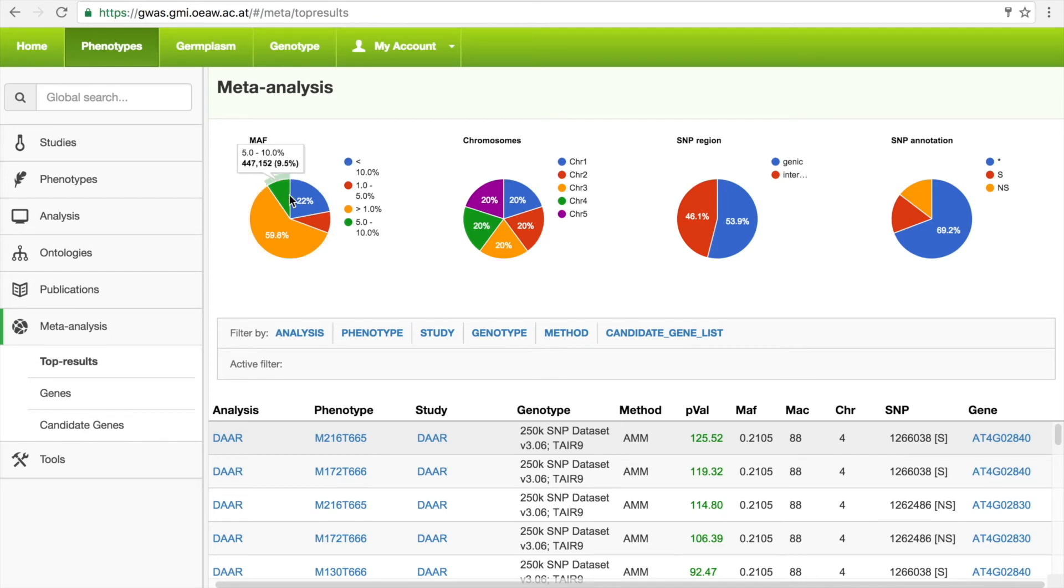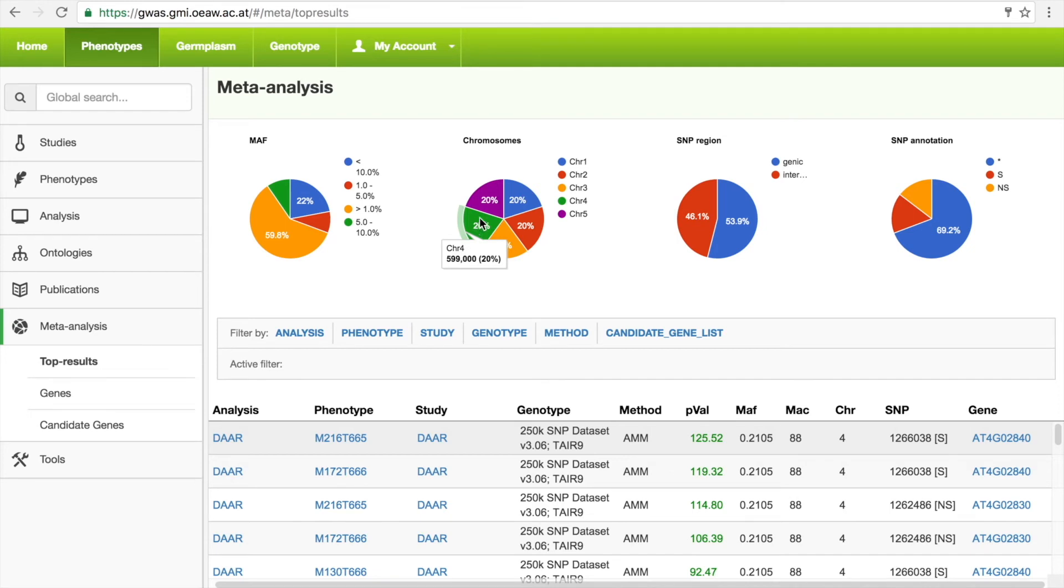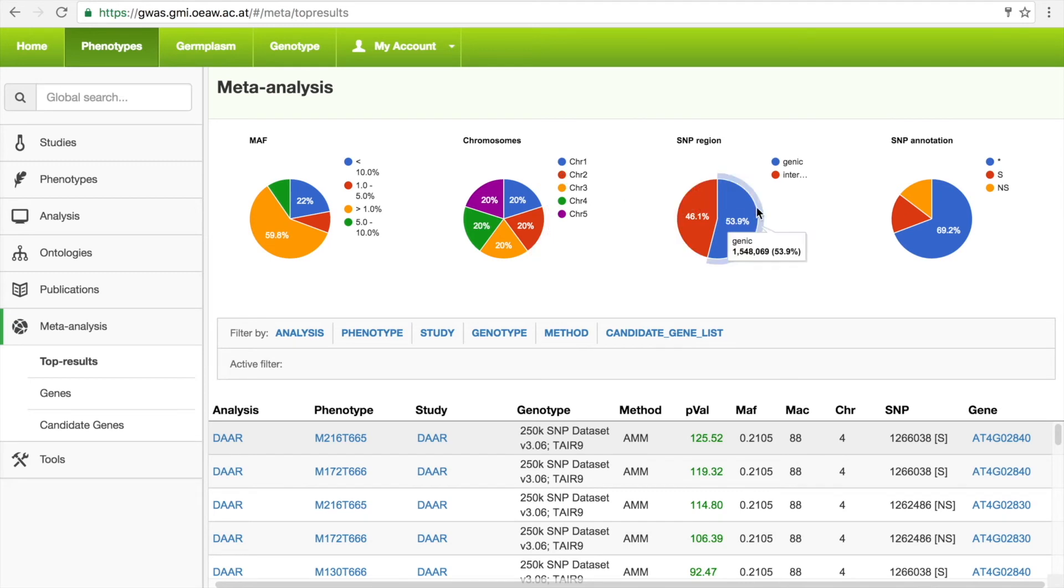Summary statistics are displayed above the table, such as minor allele frequency, chromosome, and SNP type.